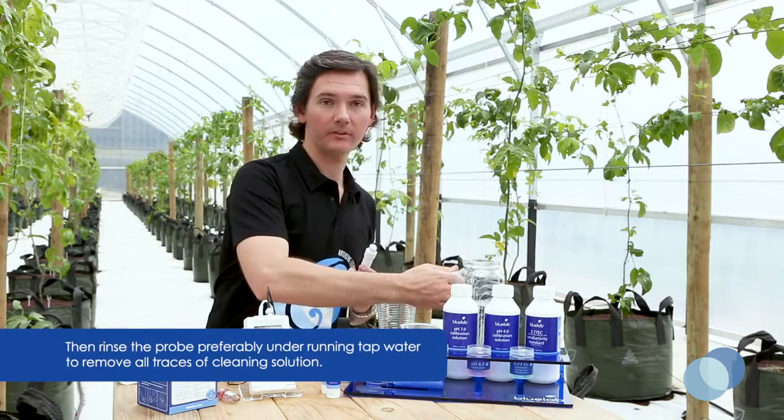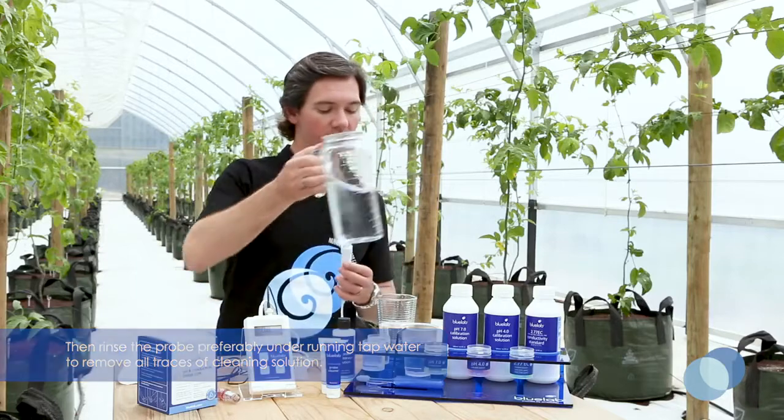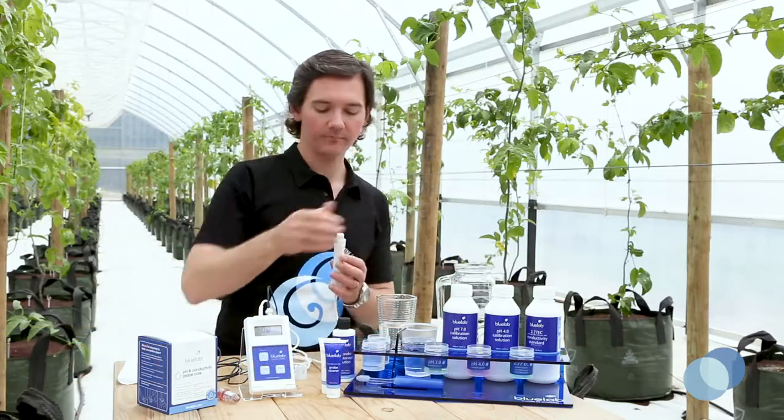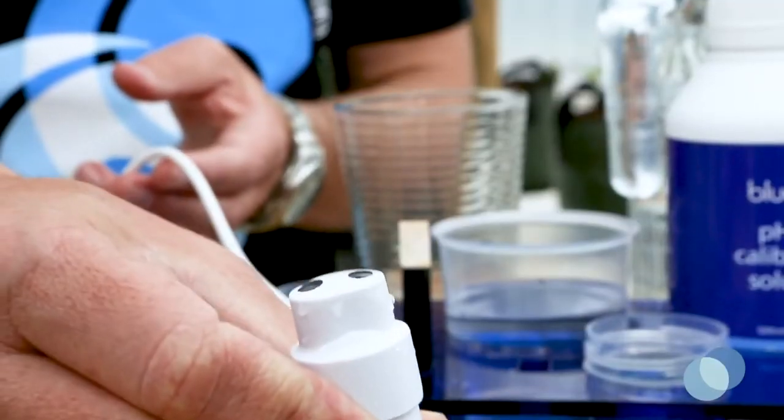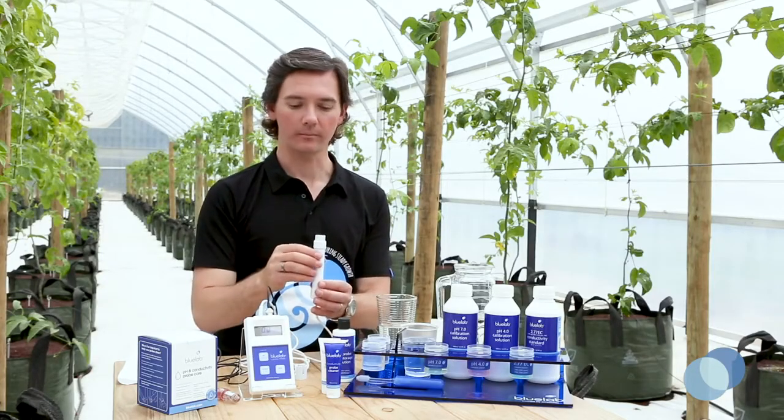Now give the probe face a rinse with some fresh tap water and make sure that there's no cleaner left on the probe face. Also check to ensure that you've got a clean smooth film of water on the probe surface, ensuring that there's no beads of water showing up.